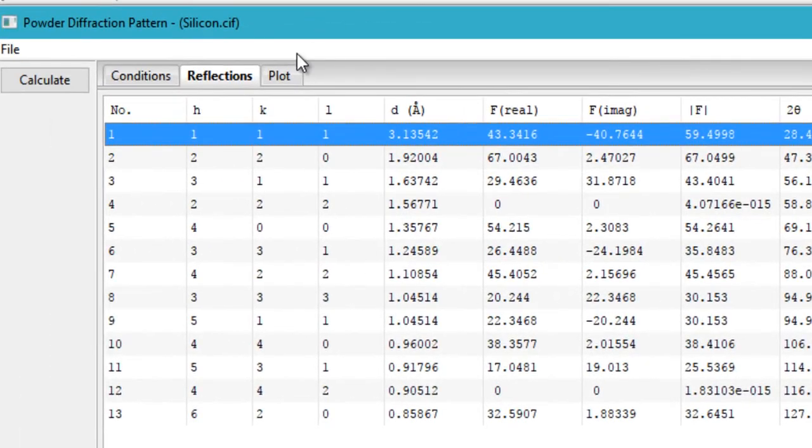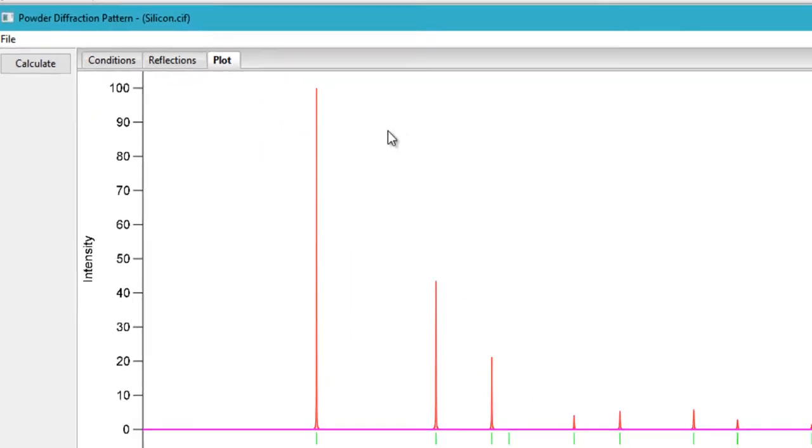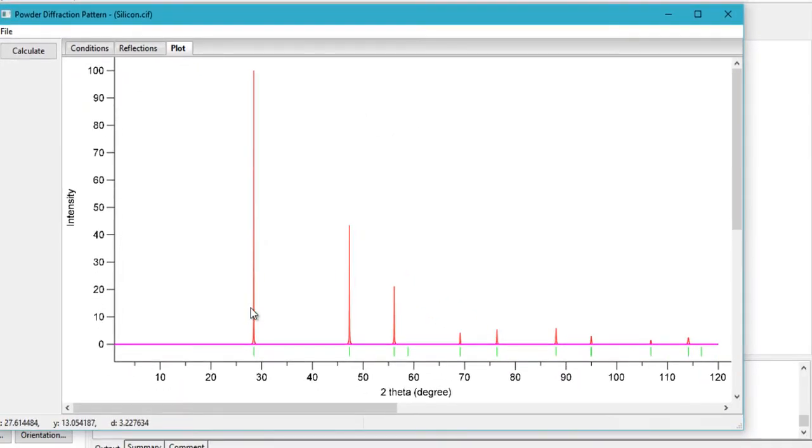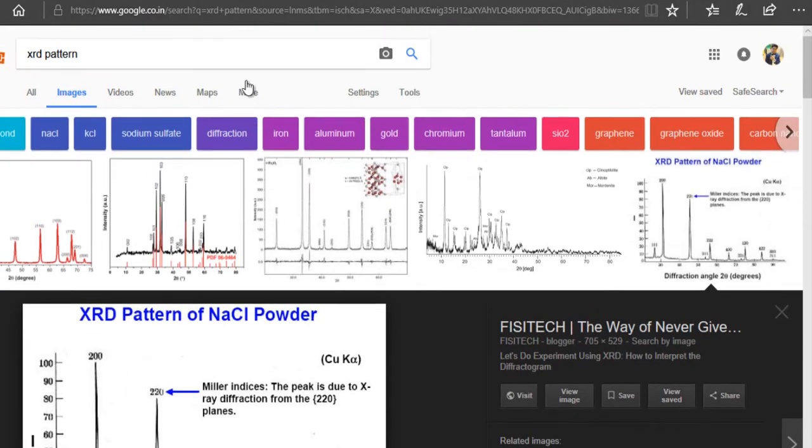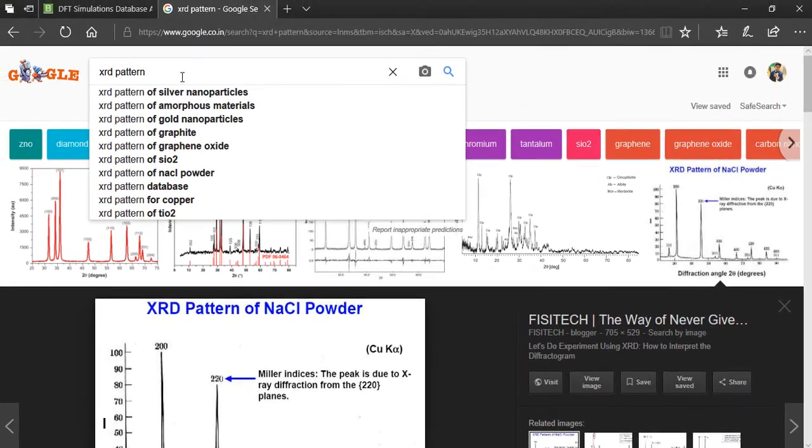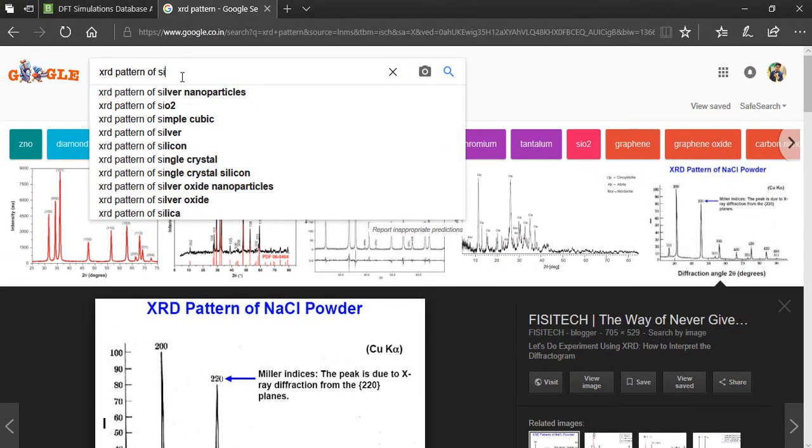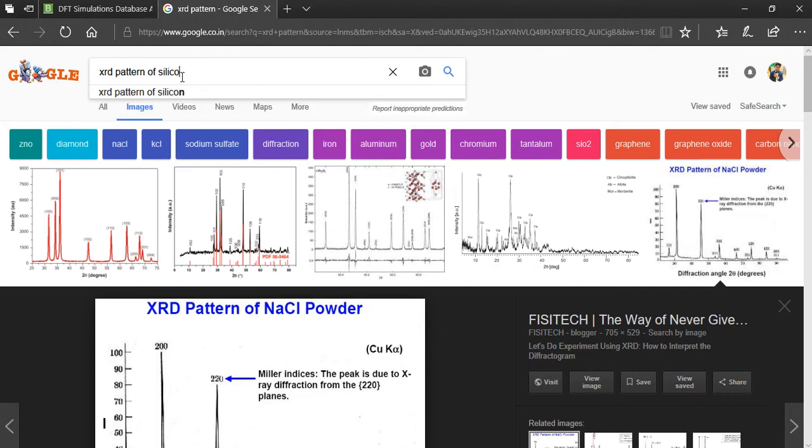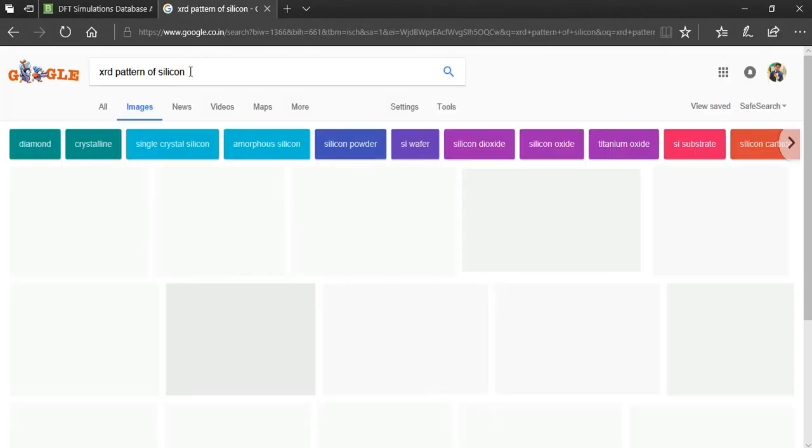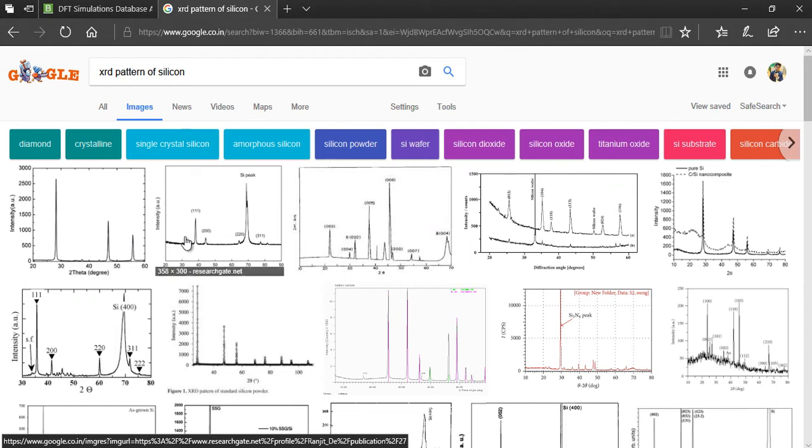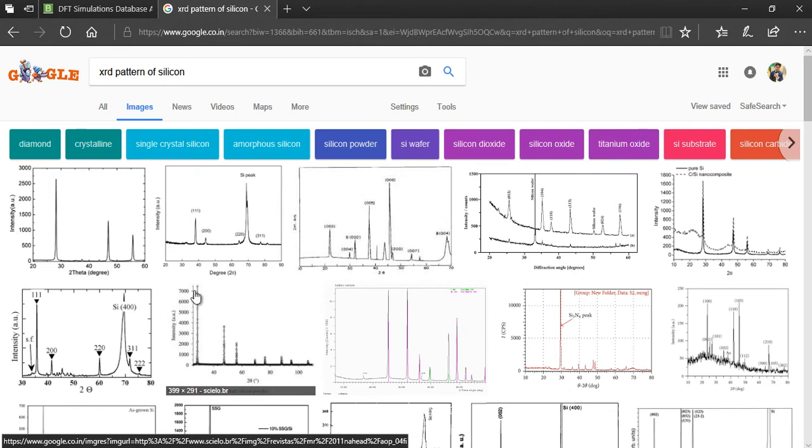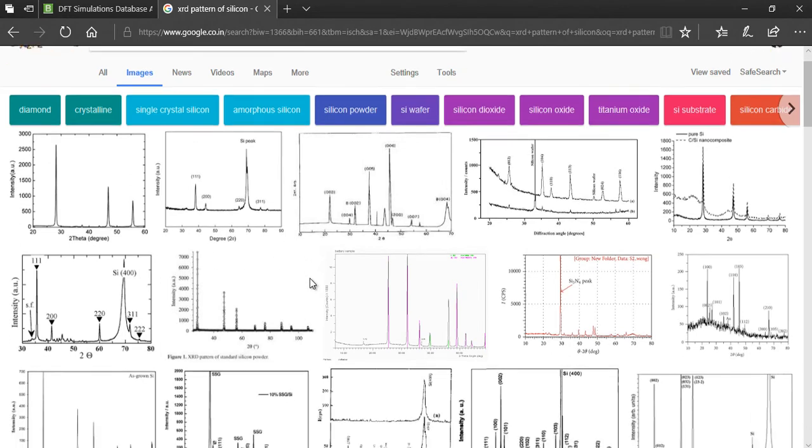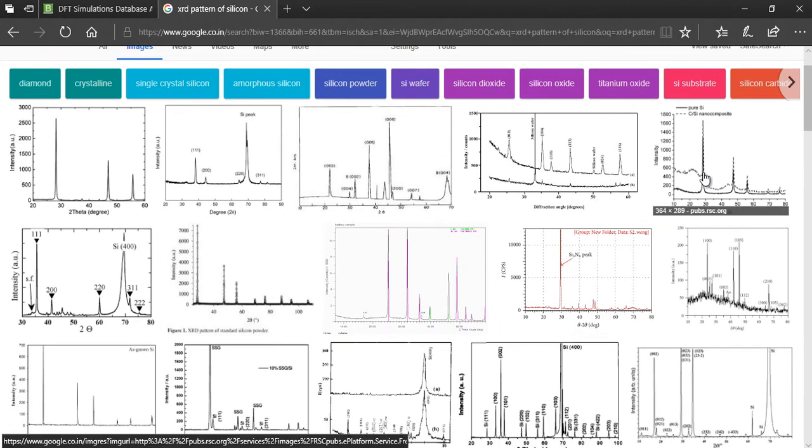That's how we simulate the XRD pattern. If you want to compare it with some other source, if you want to verify it simulated properly, you can easily Google it and then compare the patterns. Here we have the XRD patterns of silicon. Let's pick up this one.